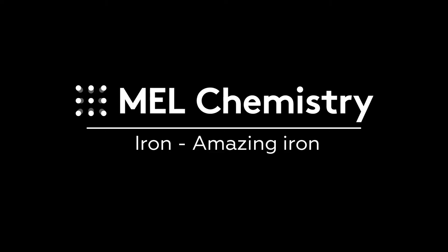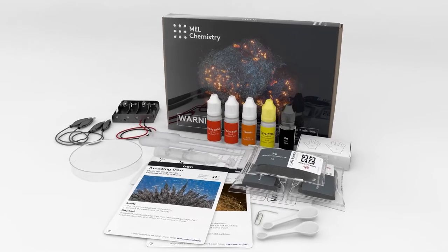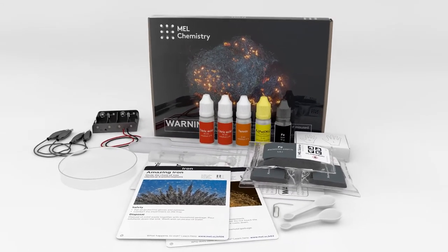Welcome to the wonderful world of chemistry. Today, with the help of the Iron Set by MEL Chemistry, we will study the chain of chemical transformations of iron.